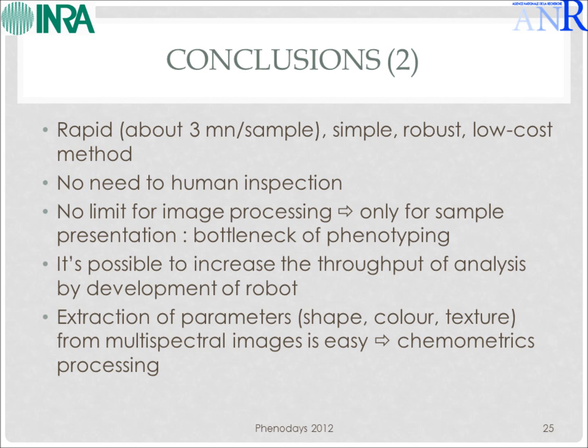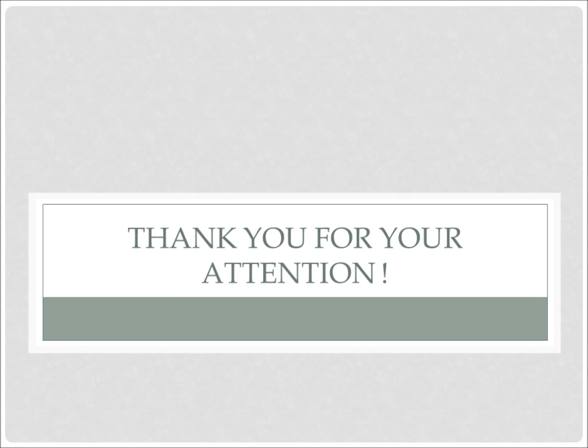In other work, we extract parameters like shape, color, or texture from multispectral images, which is very easy by using chemometric processing. So I thank you for your attention.